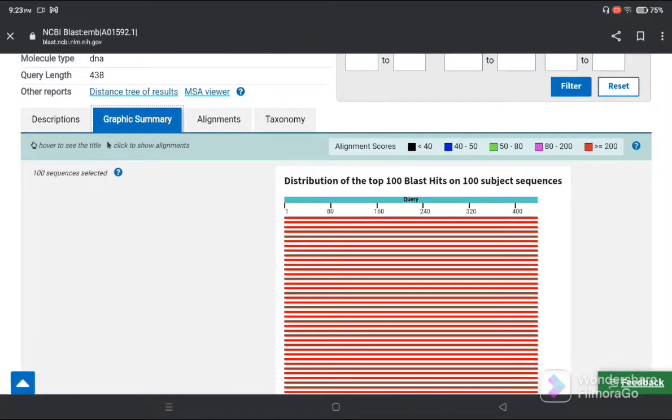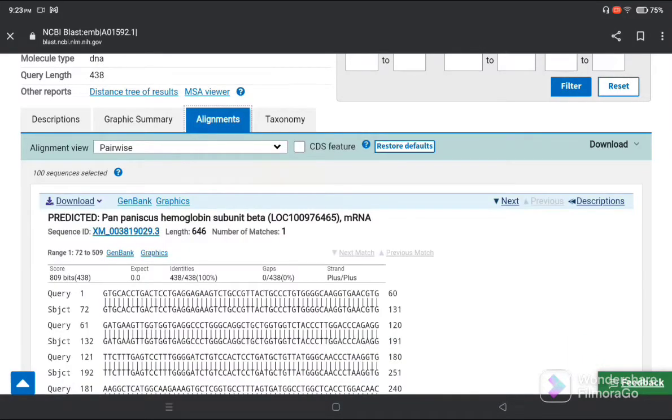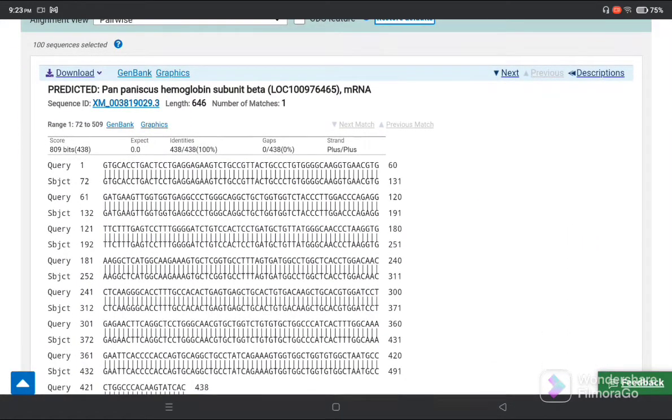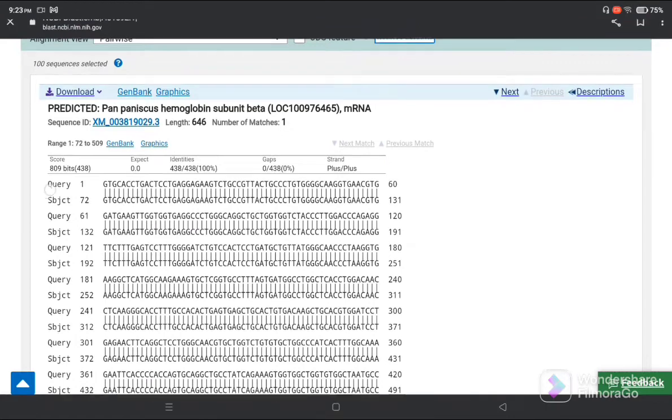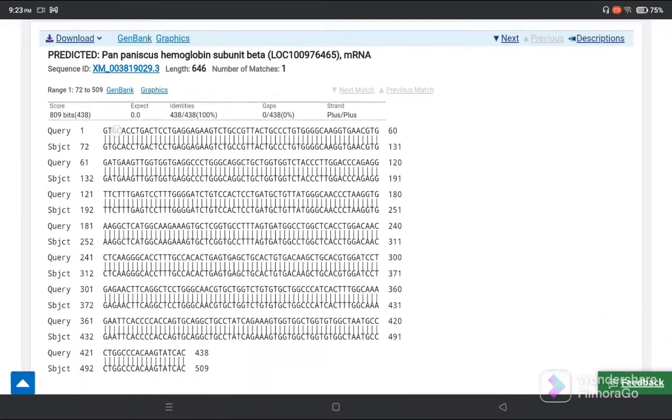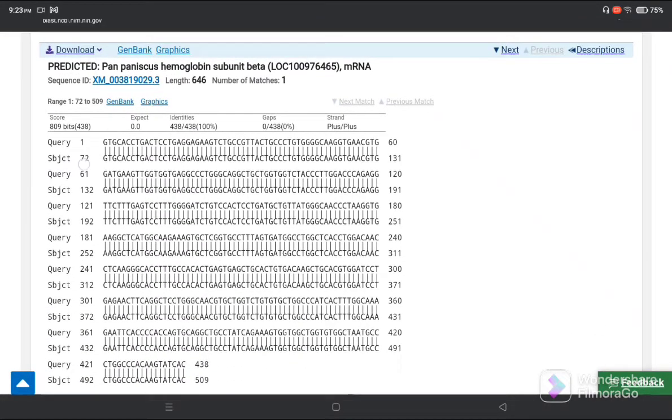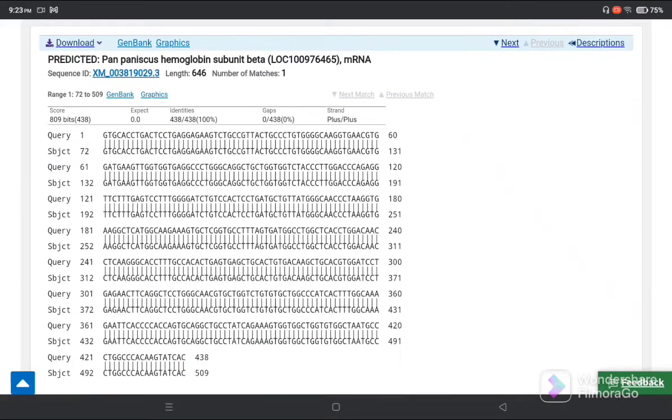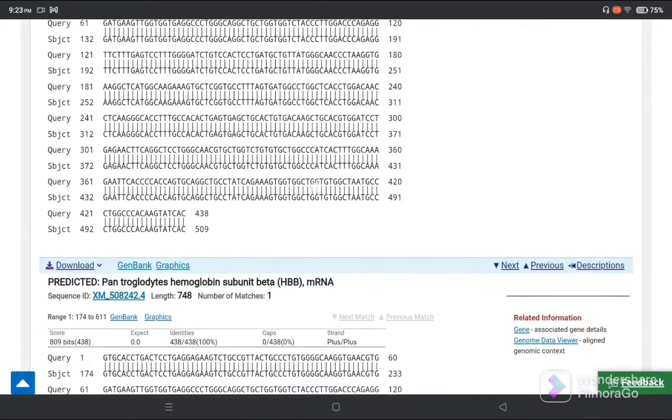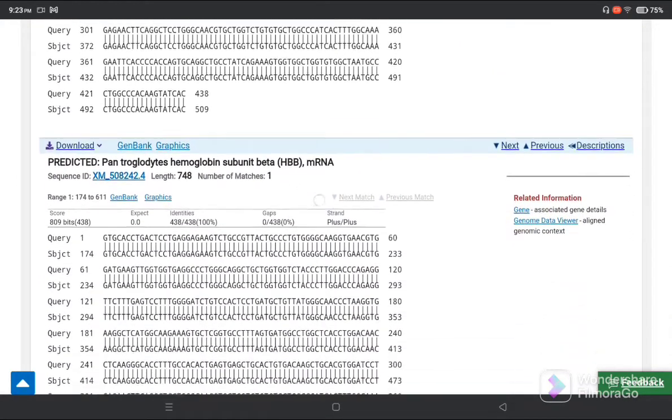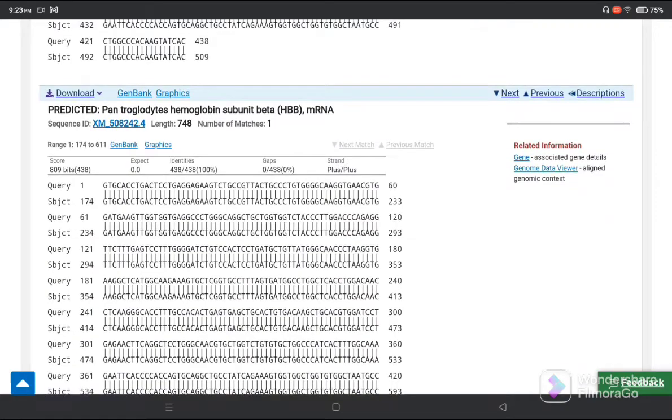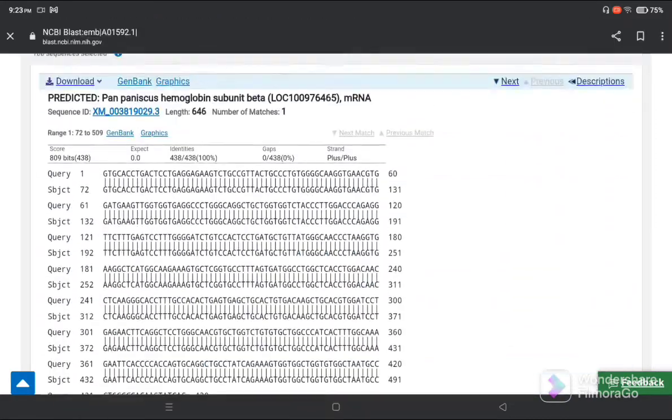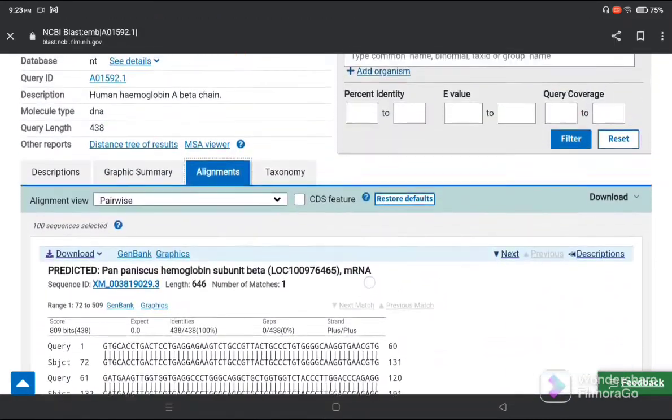Now next we go to alignment. This is our query sequence and this is our database sequence. You can see very similar. This is the alignment.